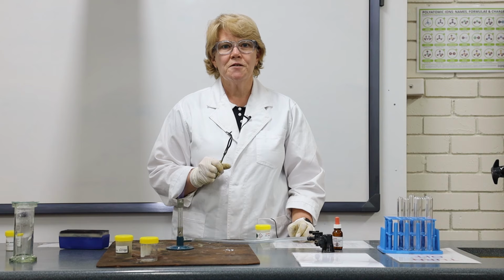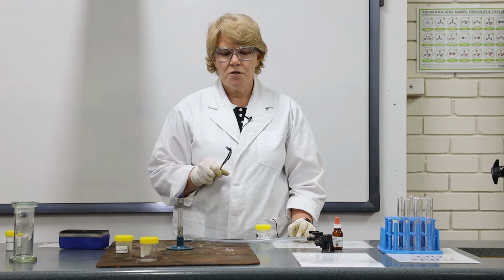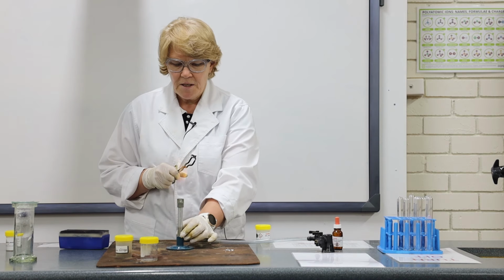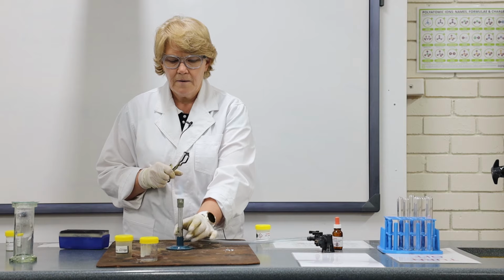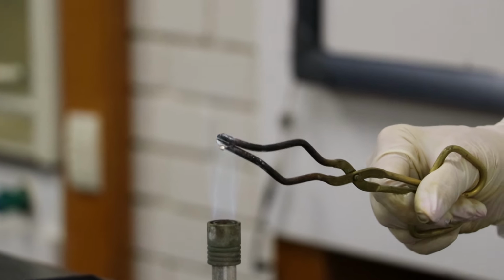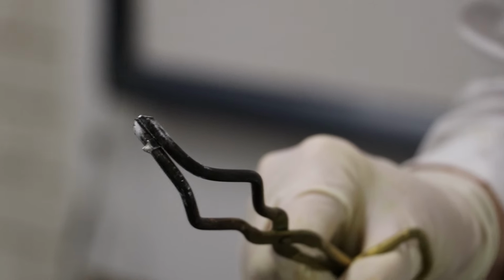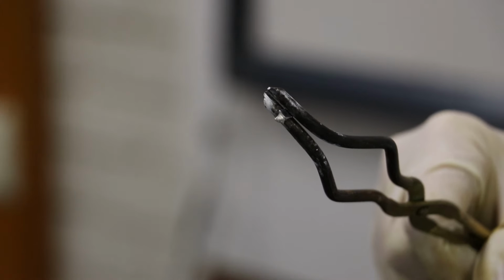Now it's time to look at the reaction of zinc with oxygen. Zinc is also a shiny grey metal. You can see how shiny that is. Now I'm going to heat that in my Bunsen burner flame and see what we get. You can see that this is also melting in the Bunsen burner flame. I'm not going to leave it over the Bunsen burner because I don't want bits of molten zinc dropping down the barrel of the Bunsen burner. Can you see any change?